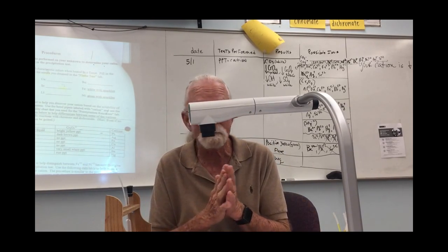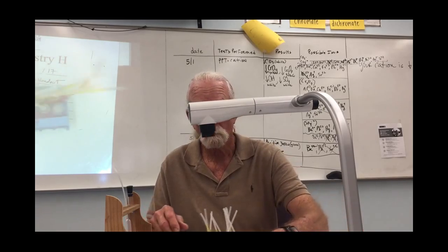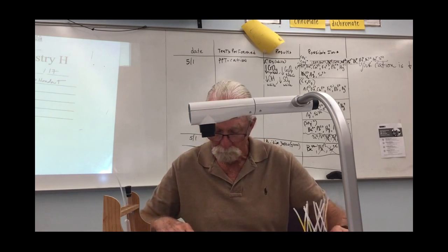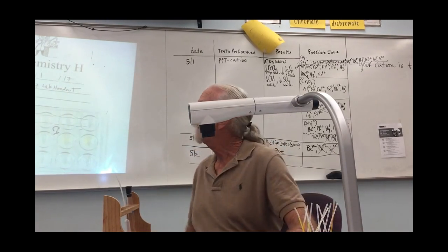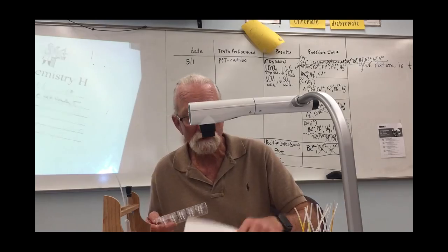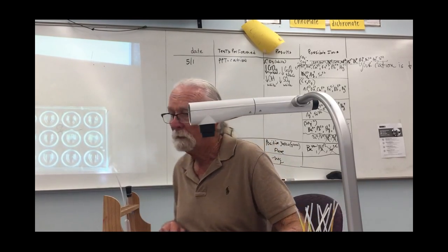So I've already made up my mind. I'm going to do my cation precipitation test. I go in the back. I pick up a tray of the cation reagents. It looks like that. This is the cation reagent tray. I pick up the matching well plate. It looks like this. This is where the reactions will actually take place, because it's a little bit easier to see them on a darker table. Your tables are black. My Elmo's white, so I needed to put a brown piece of paper up here.